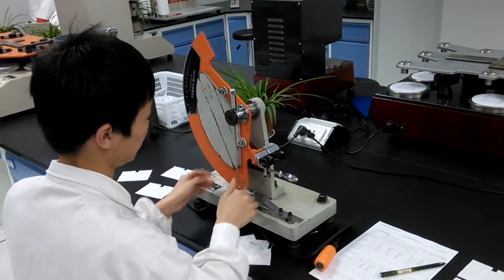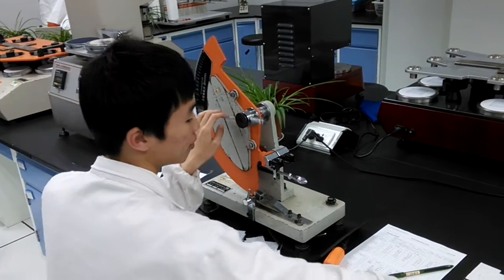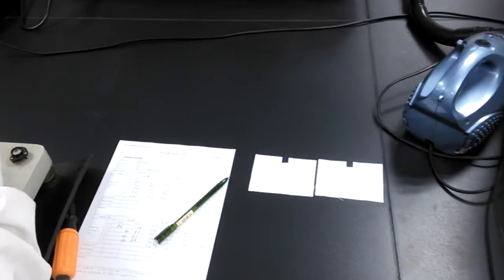This is the ASTM 1424 tearing test. First, we will cut the sample into pieces according to the standard.